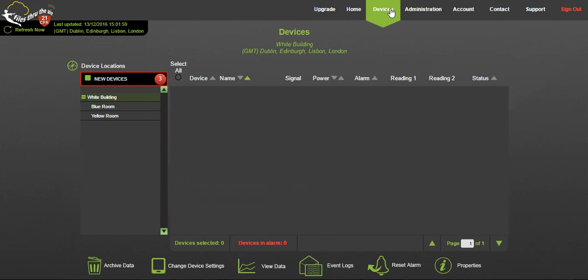This will take you to your device dashboard from where you can begin to monitor and change the settings of all your devices. Note as administrator you have authority to make any changes. Other users created in the administrator section of the site may not be able to change all settings, but for the purposes of this video we'll proceed with full privileges.